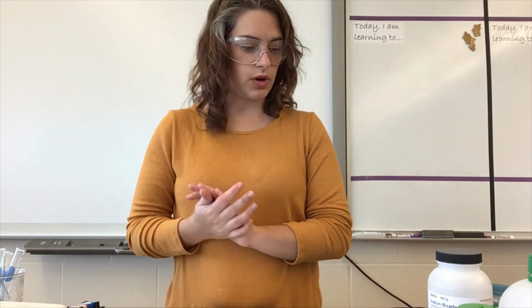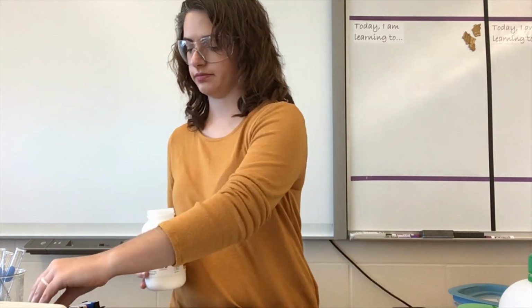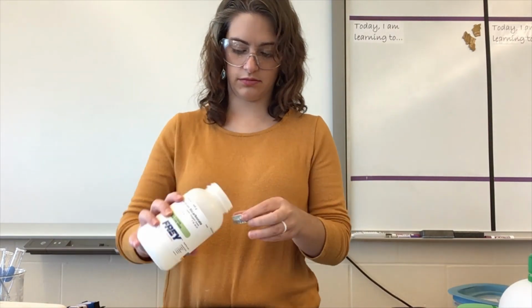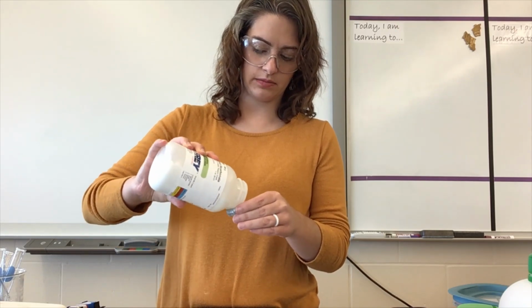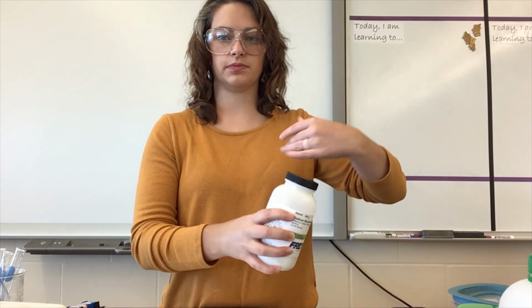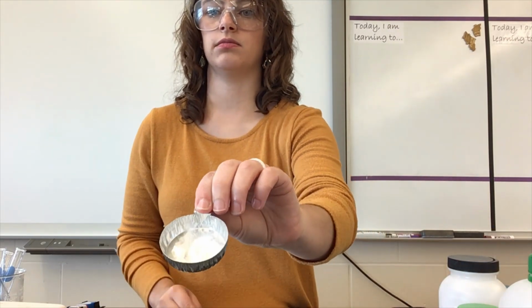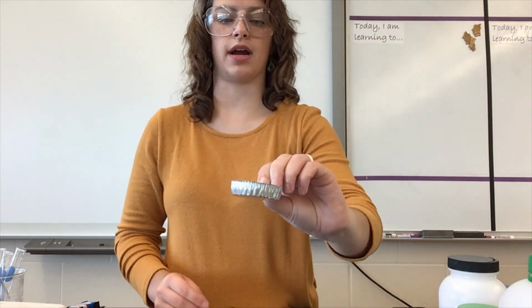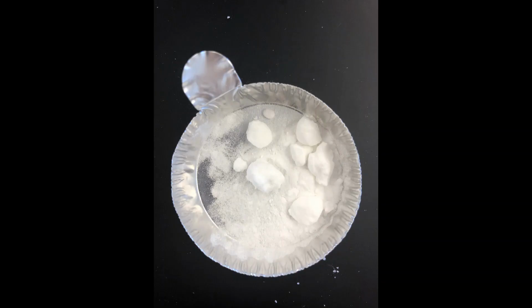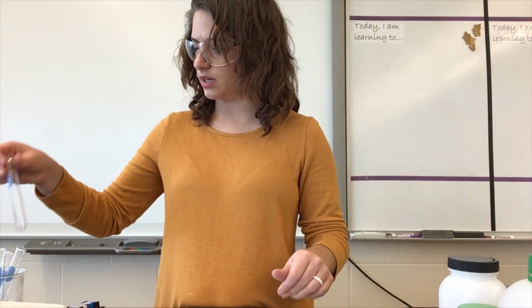Up next is sodium bicarbonate. So this guy. So here's what we got. That's our sodium bicarbonate. I'll take a picture for you. Okay, so that's appearance.